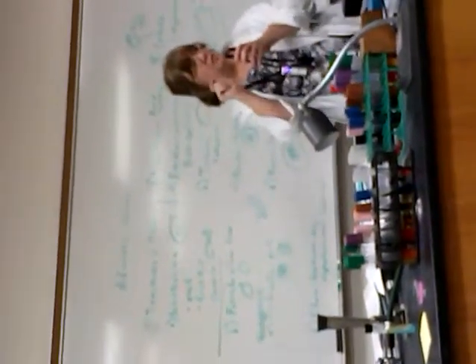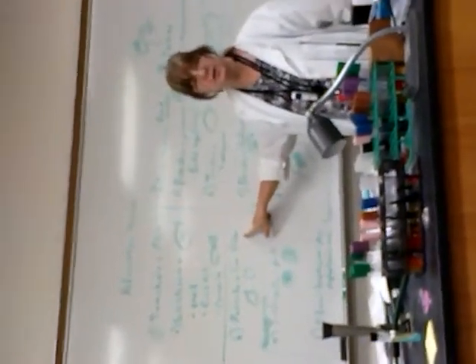Fasciola, technically Fasciola hepatica, has an egg that looks like an egg with the top tapped off, like a cap. It is the liver fluke, of course, but it's fat. Hepatica, the liver. This is the one, remember the film where they showed the meat with the bladder worms living on it? Don't eat it. Is that actually where the worm comes out of? Like, is that the cap that the worm just comes out of the top? Yeah, this usually just floats away. That breaks off. Fair enough. It can also be a larva. Okay, that is your trematodes.